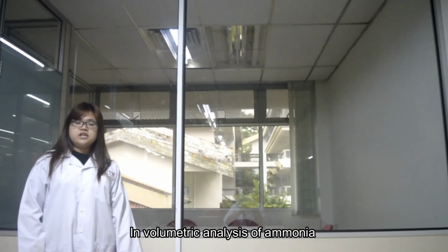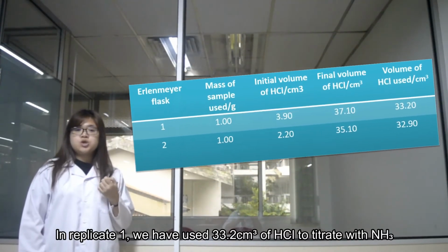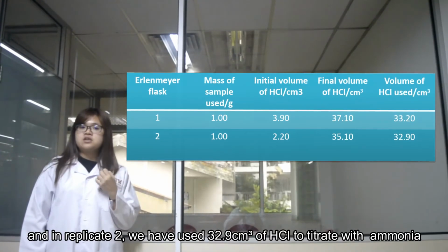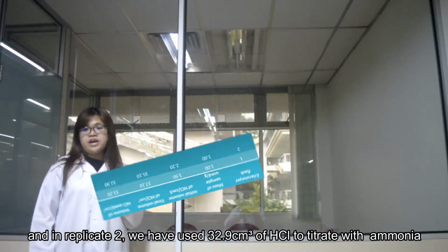In the volumetric analysis of ammonia, in replicate 1, we have used 33.2 cm³ of HCl to titrate with NH3, and in replicate 2, we have used 32.9 cm³ of HCl to titrate with ammonia.